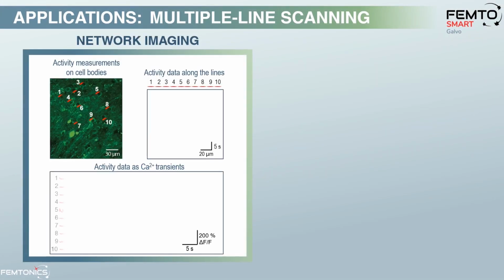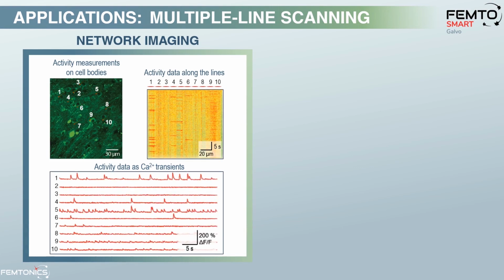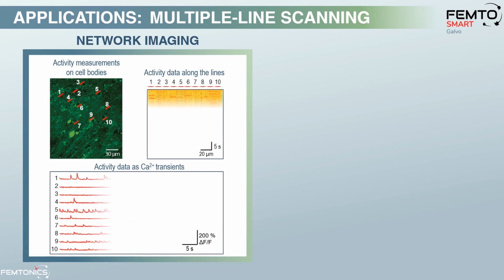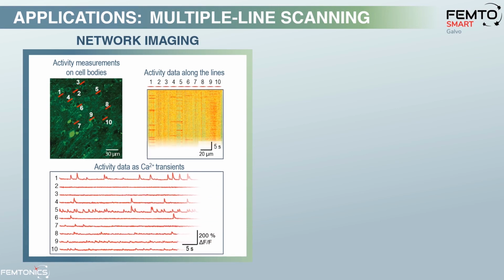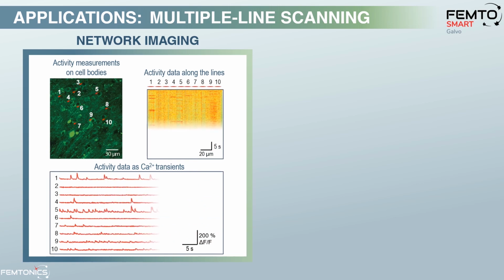Line scans are typically done by Galvo scanners. Note that the scanning is in fact always continuous, but the software interprets only the signals coming from your defined patterns as meaningful, which happen to be lines in this case.